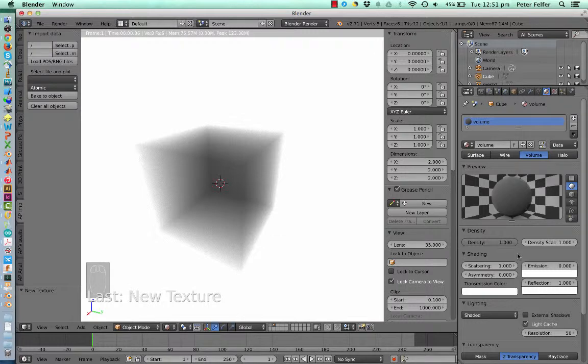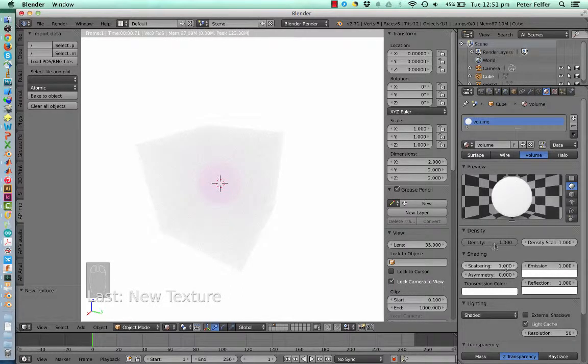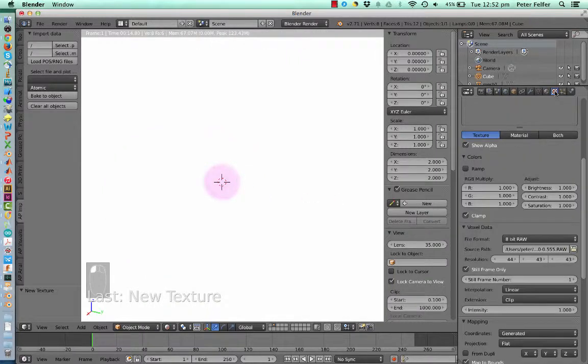Anyway, here you can see with the density we've got no emission yet, so we want to have emission set to 1, scattering to 1. The reason why we weren't seeing much was because there was a lot of scattering going on, so we need to set the scatter density to around about 0, and now you can see the volume. So this is actually already a volume rendering. Now it's slowly building up, but we haven't made it pretty yet. So going back into the voxelisation, we'll just change the colors for that.